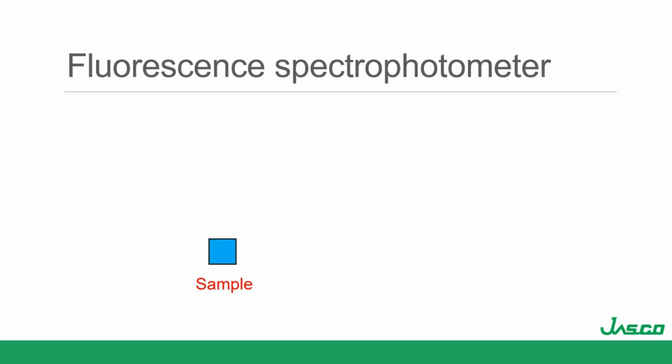What do I need now? What we talked about was Beer's law. Beer's law says fluorescence is proportional to the intensity of the excitation light. So I need a light source, right? And it's usually a xenon lamp. It can be continuous or flash lamp. Continuous has the added advantage that it has a significantly greater output. And so, again, remember, more light in, more light out, you get a lot more sensitivity with the continuous sources.